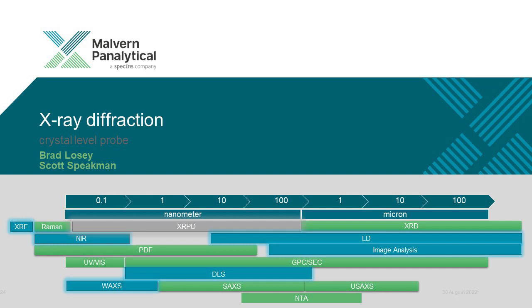The other technique that you can use, which is more of an R&D technique but is now also going into quality control, is X-ray diffraction. X-ray diffraction looks into the crystal structure of the material, and most of these battery materials are highly crystalline, so they have a given crystal structure. The properties of these materials depend on what kind of crystal structure or crystal phase is present.